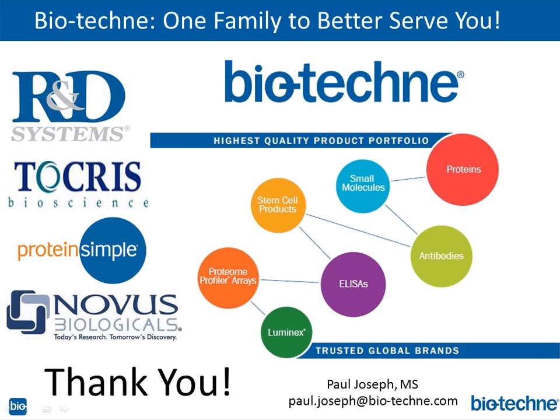Another approach I will suggest that you most definitely can use to assess this is Luminex. R&D Systems has, I don't know if you're studying mouse or human, a bead-based assay. It's actually quantitative, and it uses multiple standard curves from the same sample using a 96-well plate. You can most definitely assess, in a picogram per mil fashion, multiple protein quantitations, cytokines, chemokines, PDL1 from the same sample. So if you want to get quantitative on cytokines, I think your approach is to try Luminex assays.